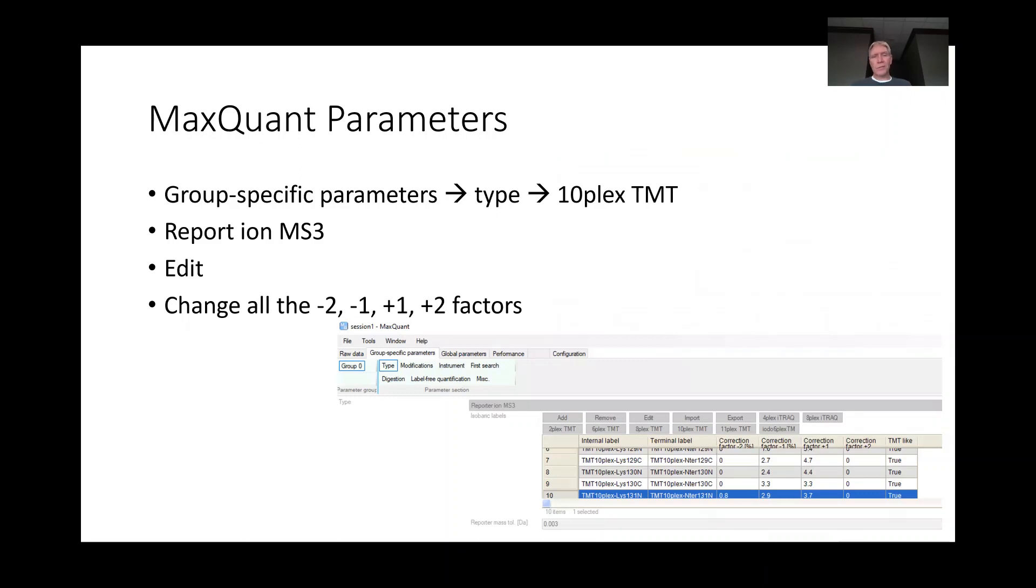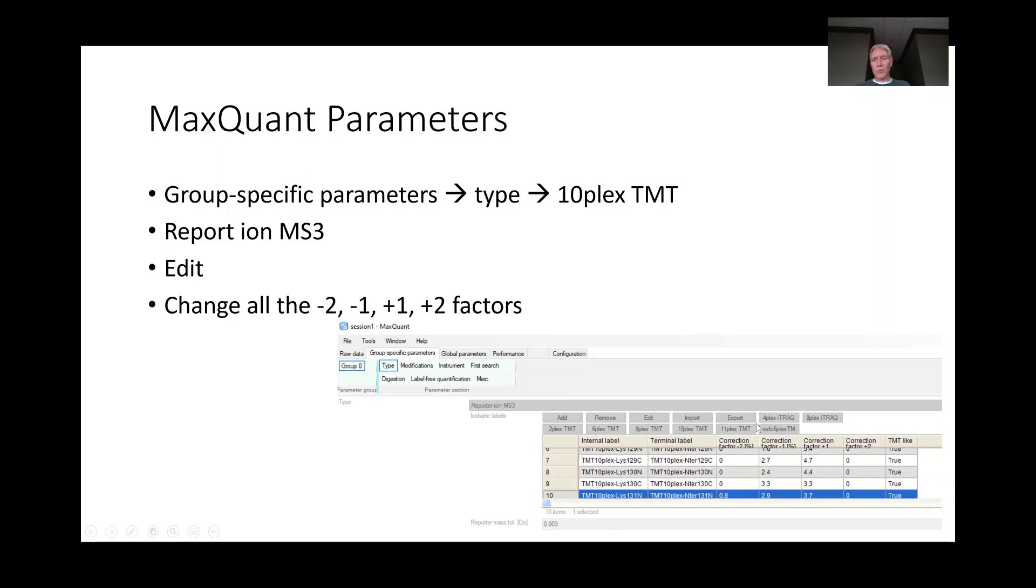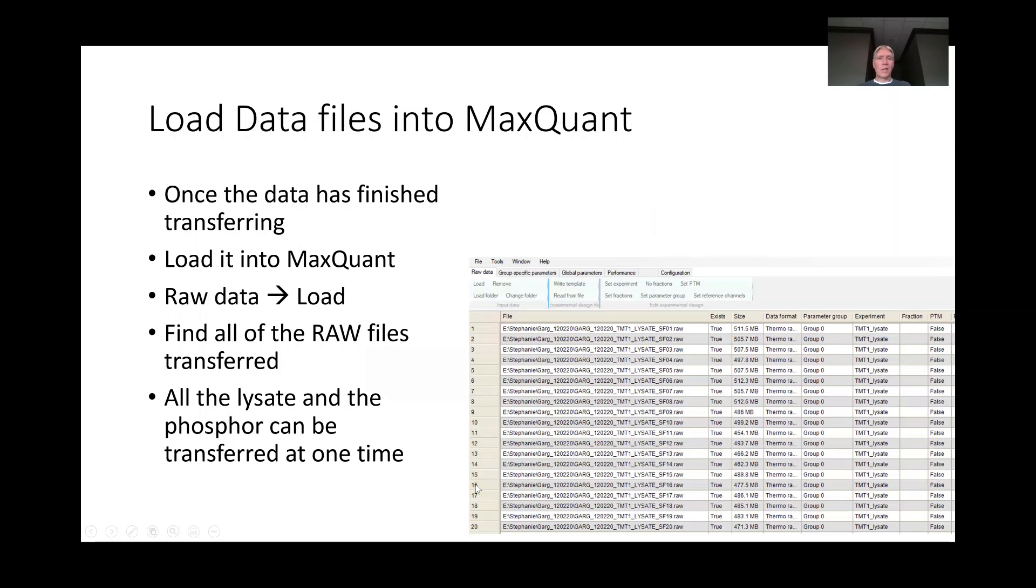I'm going to go through this example here. When you go into MaxQuant, you need to go into group specific parameters, then you go into type, and then click this box that usually says standard and change it to reporter ion MS3. Then it will pull up this box below where you can select whether it's a 10plex or a 6plex, and then we can change all those correction factors based upon the kit that we're using.